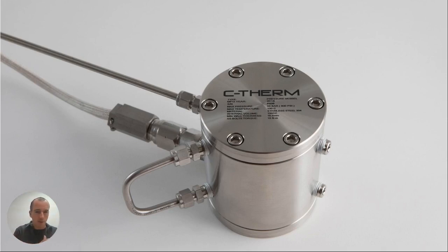Often we're trying to model it from a process optimization or process safety perspective, or it's an underlying characteristic that's very important to the ultimate performance of the material. So it's important to really represent those conditions in the testing of the material. You can get some very non-representative data if you do not pay close attention to some of the environmental considerations, how the sample is oriented, the environment in which you're testing it. If you don't watch those things carefully, it can really impact the quality of your data.